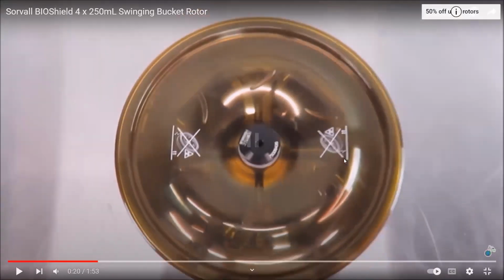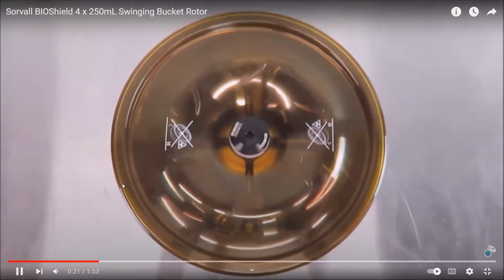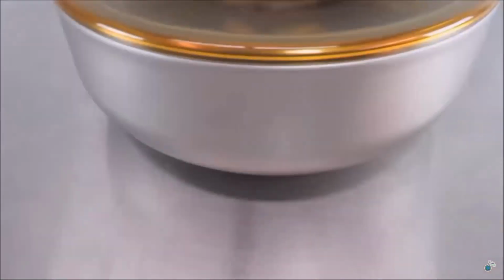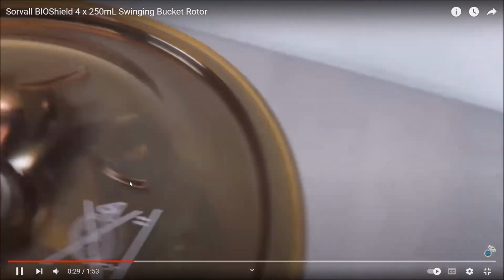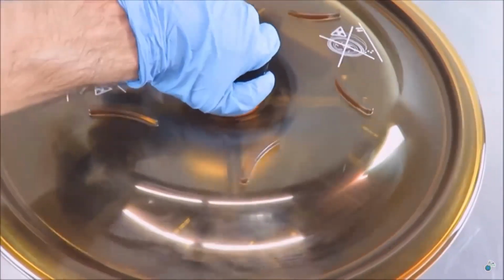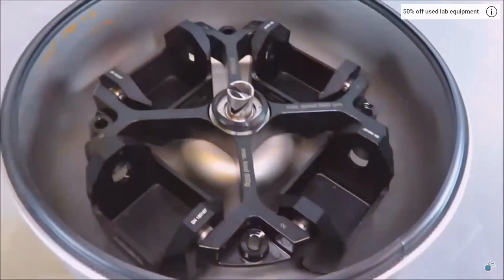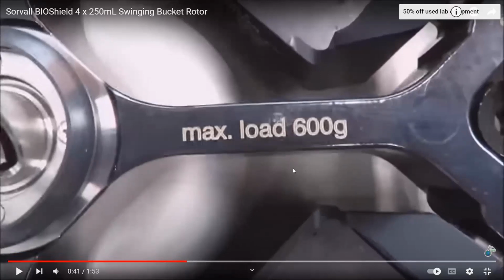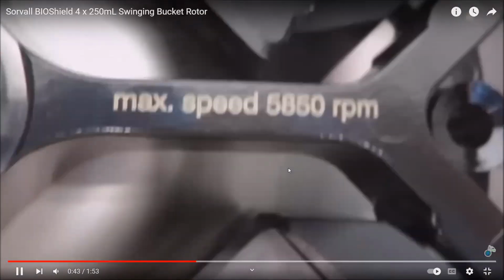So you can see that there's a lid, and you'll see that there's some sort of a holder. That is not a holder actually, that's a holder cum screw, which will be connected to the shaft inside, to that axis inside. Yeah, so you see maximum load is 600 grams, not beyond that. Your sample shouldn't be like 700 grams or something.